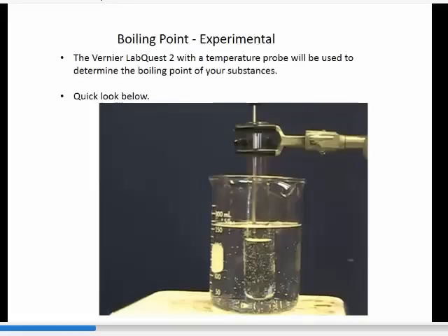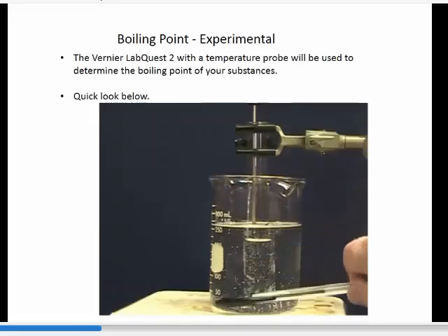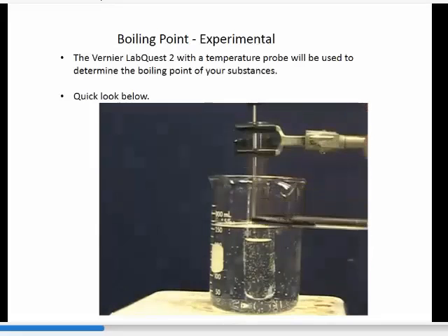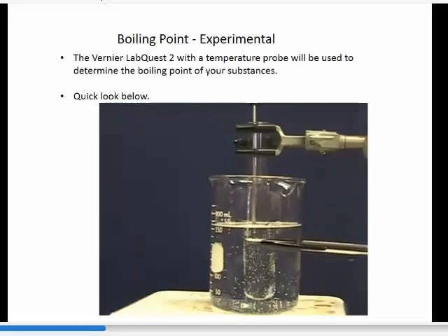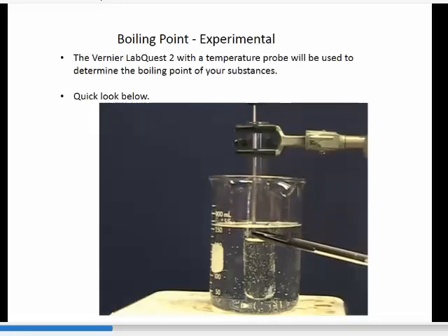Just a quick look at the experimental setup for the boiling point part of the lab. We have a hot plate set up. Up in here, it's just a beaker of water, a beaker about two-thirds filled. Inside of it, you'll see a test tube. Notice carefully that this line is where the liquid level is inside of my test tube. You want it down below, so you have it very well immersed in the water. And up here is the temperature probe coming out of the LabQuest. The tip of the temperature probe goes just above the surface of the liquid in the test tube. It does not go in the liquid. As the system heats up, it's going to start dripping off the tip of that temperature probe.